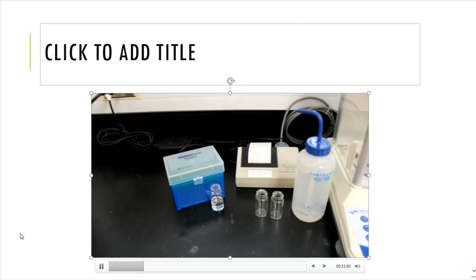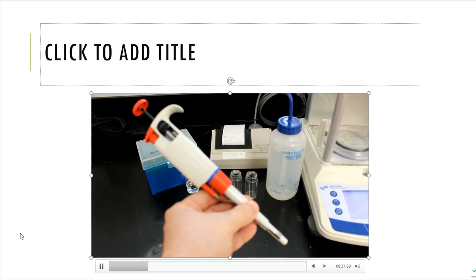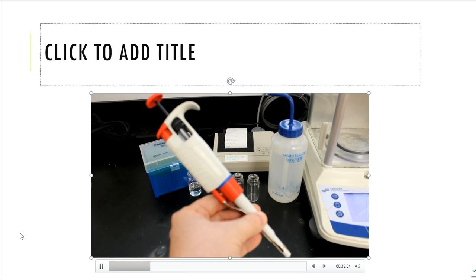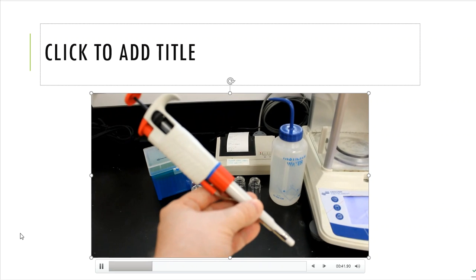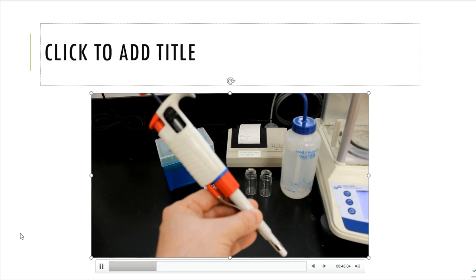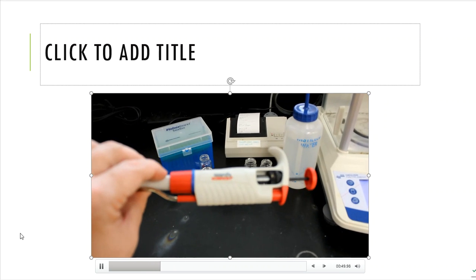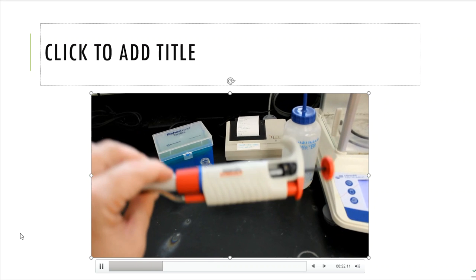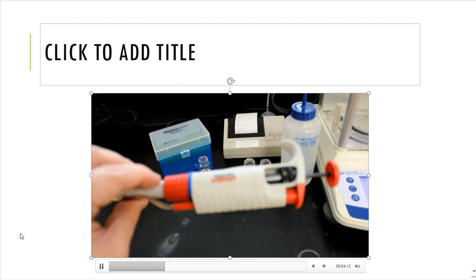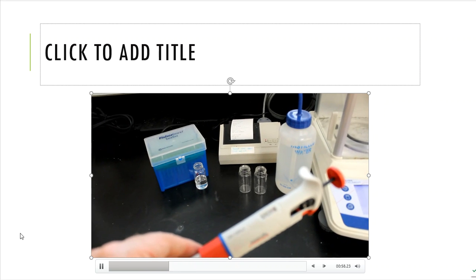Well, there's a couple of ways that I can do this, but I'm going to be using what we call a micropipette, and this is what a micropipette looks like. It is a way for me to measure out volumes, and that volume is going to be very specific. This is much easier, much quicker, and better than an old-fashioned glass volumetric pipette. However, sometimes we still need to utilize those glass pipettes when we can.